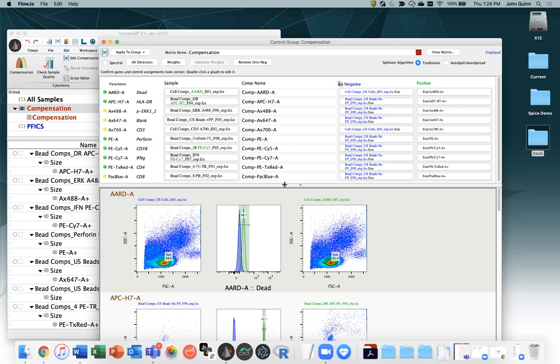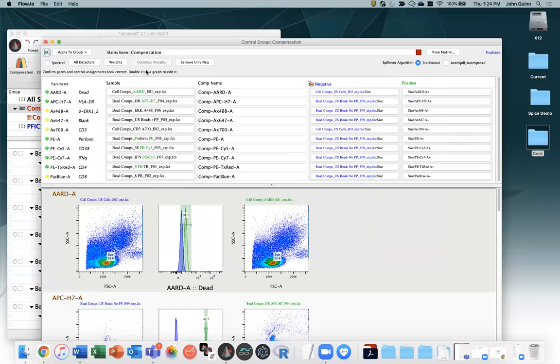We can use the fluorescence in every other channel as an exemplar of how much AutoSpill we're going to see. Sorry, how much spillover we're going to see. We'll come to AutoSpill, I promise. How much spillover we're going to see in all of the other channels so that we can subtract it out. Okay, so right here's a list of the parameter and the sample that we think is the best example of a single stain control for it.